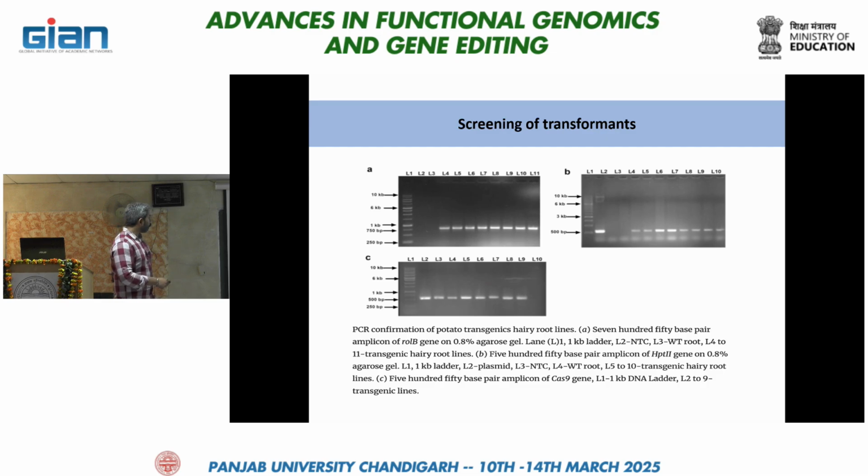You have to select all the positive lines, and you have to only use those positive lines to further detect mutations. Suppose you have a gene of length, earlier we have taken 1500 base pair, that PIF gene, our candidate gene was 1500 base pair in our previous tutorial.